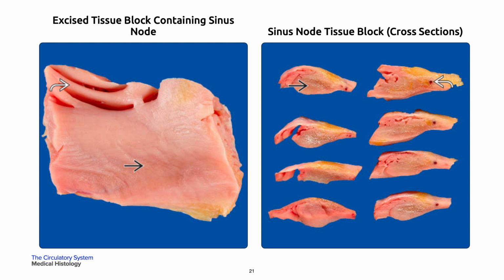On your left is the block viewed from the endocardial aspect. This excised tissue consists of a portion of the terminal crest, in a single black arrow, with a few pectinate muscles, in a curved white arrow, attached. The overlying epicardium, facing down, is intact and not seen.